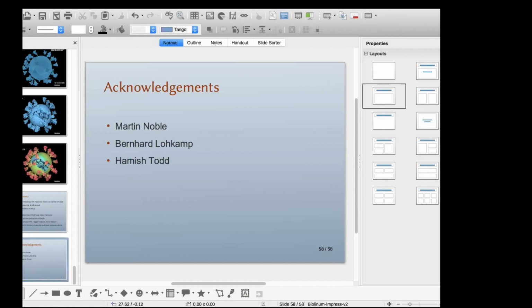So I like it too. I'm attached to it. However, it's been a long time since I've upgraded Guile, and I don't know what's in store for me when I make the change to GTK3 and Guile. I don't know whether that is a 5-minute job or a 5-month job. It's a bit unknown. Okay. Unknowns, if you've got them nailed down, that's good to know.